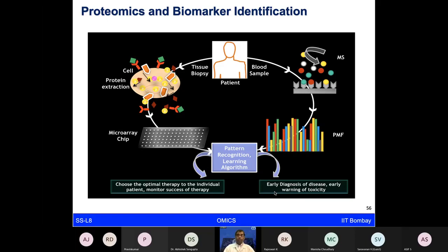Now coming to the realistic situation, when we talk about any project, the project does not involve just only microarrays or only mass spec or only SPR or only chromatography. Any type of project actually eventually involves all of these technologies. So when we talk about a simple project like, let's say in this case COVID, and we are having blood samples which we want to analyze, you are doing the protein extraction, doing the mass spectrometry analysis, finding the PMF and MSMS analysis to find out which are all proteins present from the virus as well as the human side and want to analyze those with the databases.